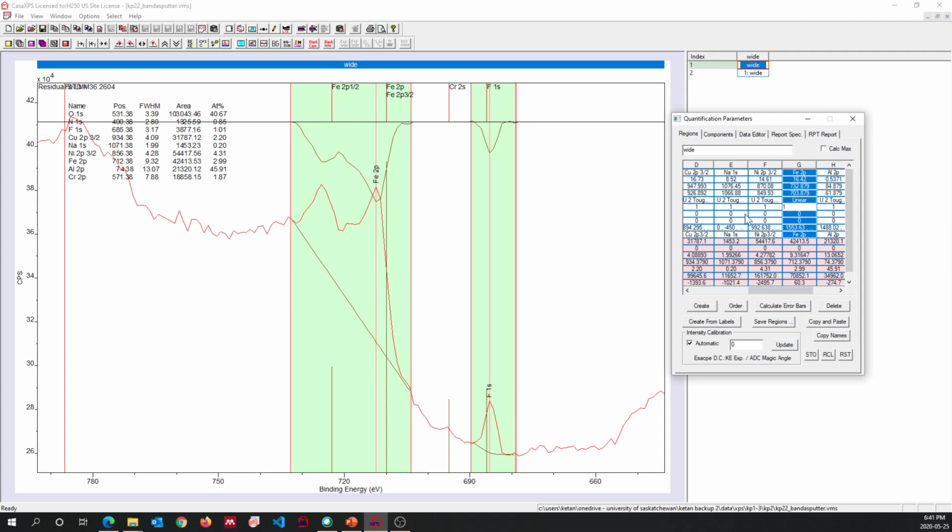This is a linear line. You can also use linear. For linear I just pressed L and then enter. For U2 I guess you have to type U2 then press enter. I think there's a space between U and 2. Yeah, space between U and 2, and then it's a U2 background type.